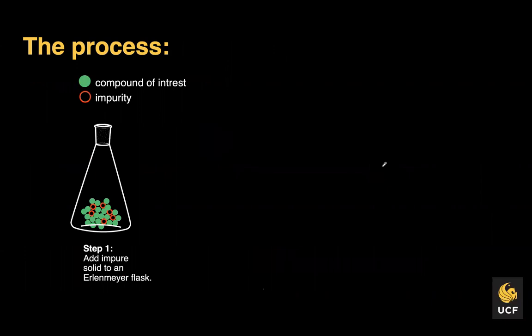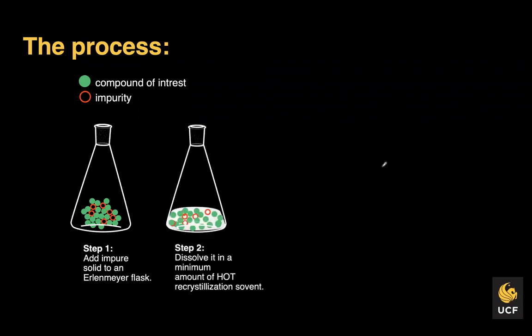So this video will really focus on the technique. The experiment itself and the detail is in the video. So what exactly is the process? What you'll do is you weigh an impure solid, right? It has however given amount of impurities. We're going to place it in a flask, and you've already tested what would be a suitable recrystallization solvent.